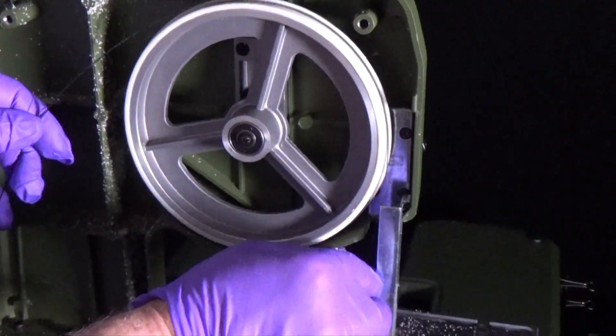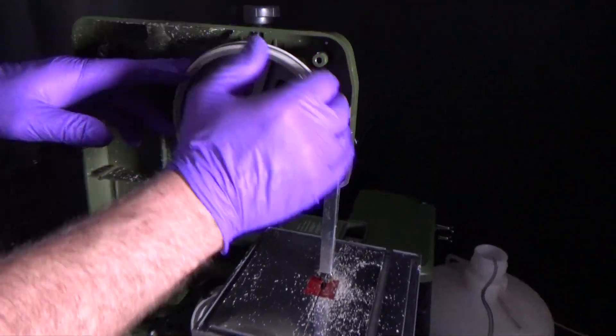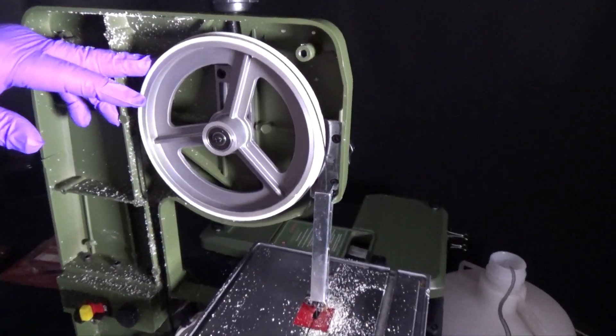To insert a new blade, wrap the blade around the upper and bottom wheel and make sure the blade is inserted properly. Tighten the knob in the back and bring the blade down.